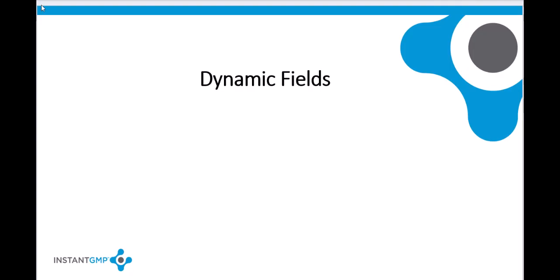Welcome to InstantGMP. We're excited to introduce our latest innovation, Dynamic Fields, a powerful enhancement to our electronic batch records. Built to meet GMP standards, Dynamic Fields expand data capture capabilities and bring flexibility to the manufacturing process.